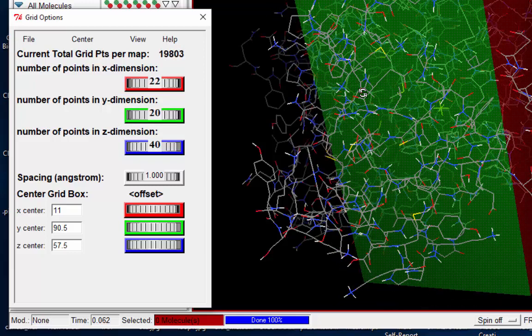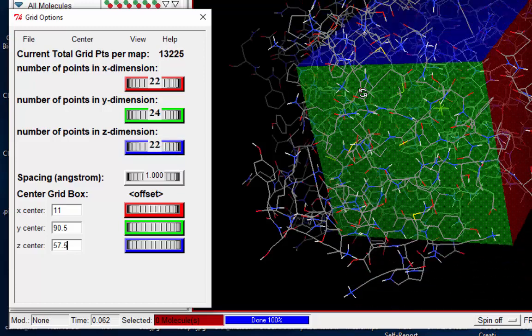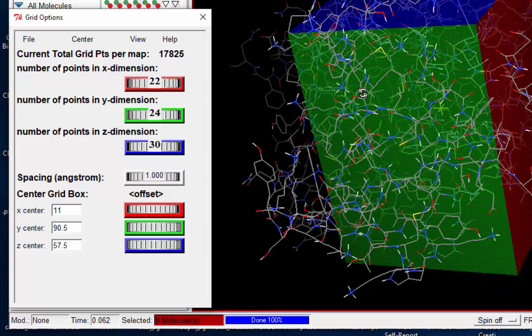Oops. 24, and then 28. Okay, all right. Now we're at the same place as he is.